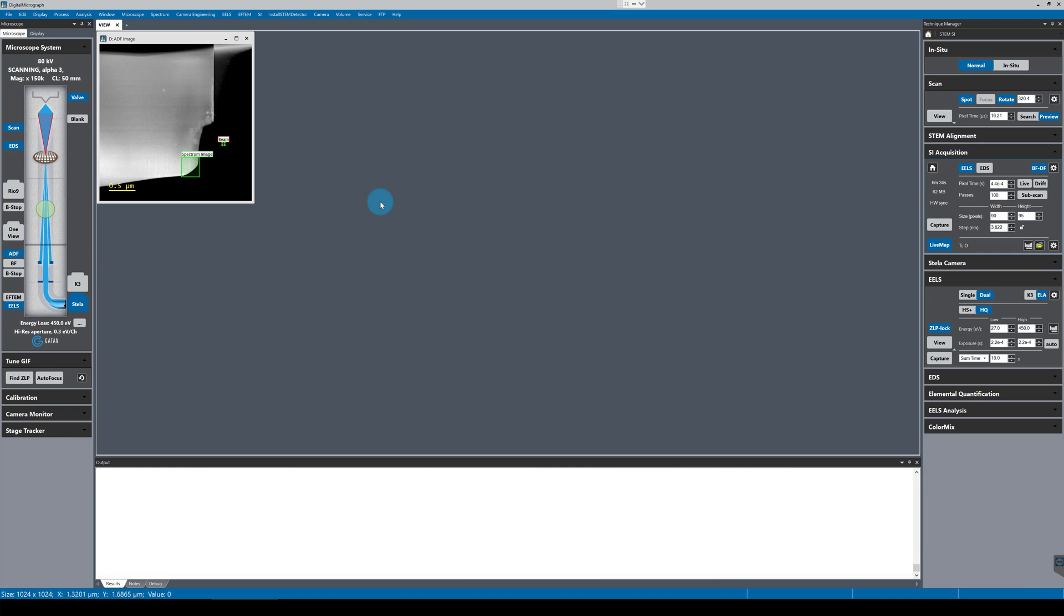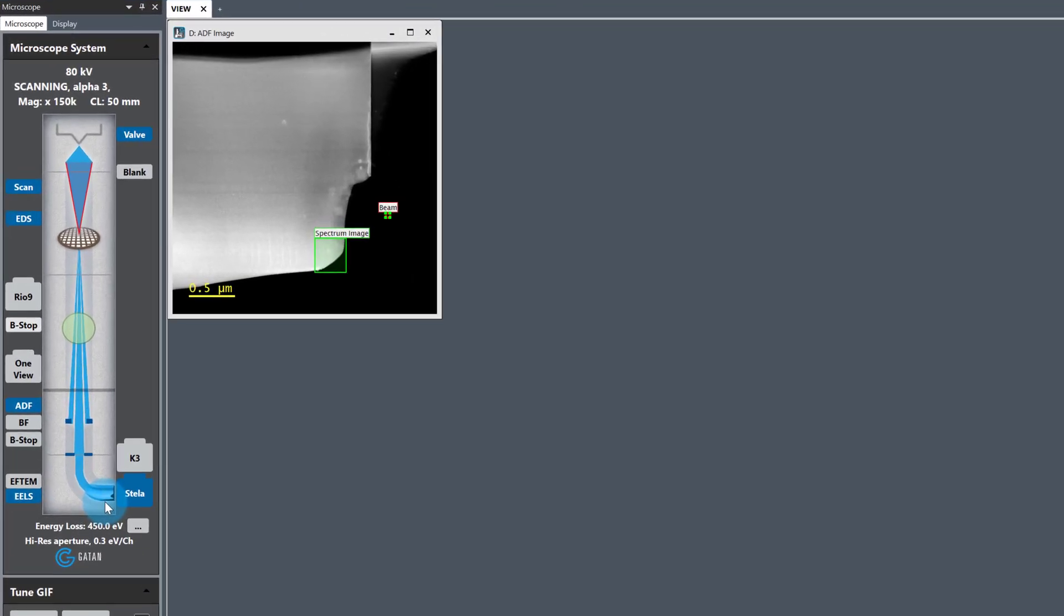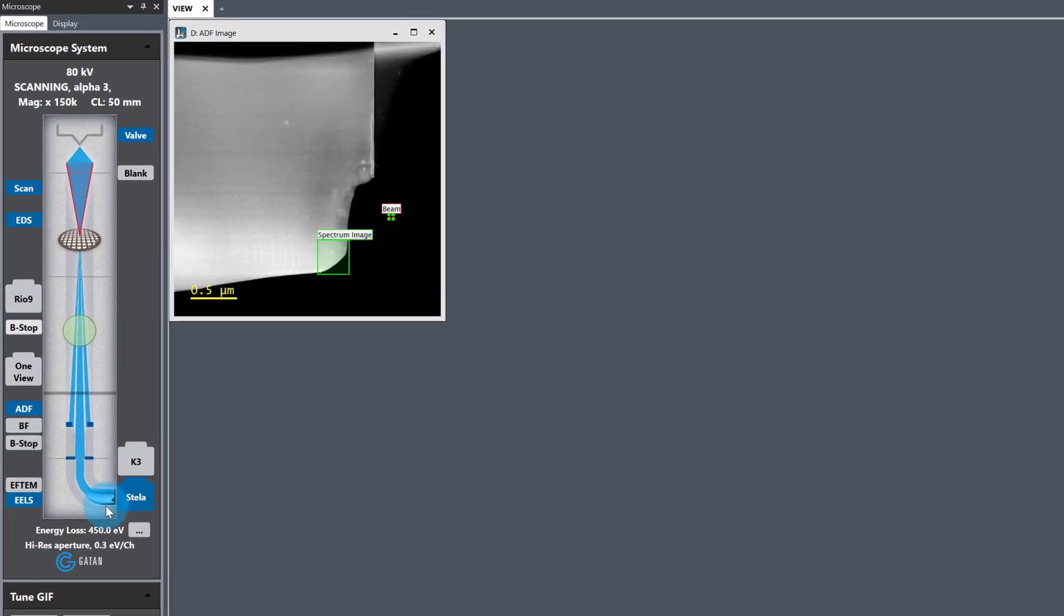As you can see from the microscope user interface in digital micrograph, we have a fully loaded system but I'm just going to be focusing on the Stellar for now.